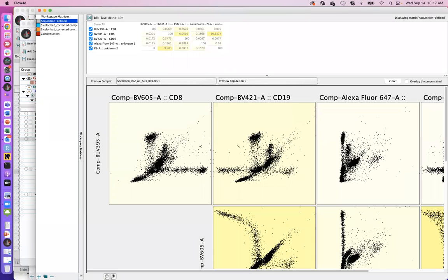If this happens to be the double negative that I'm waving my little mouse around, one has to beg the question then, what is this really weird population that is even more negative than that off towards the left, right? So again, because the medians of the single positive populations here are askew of the double negative, we know that something is wrong with the compensation, in addition to the hooking that we can see over here.